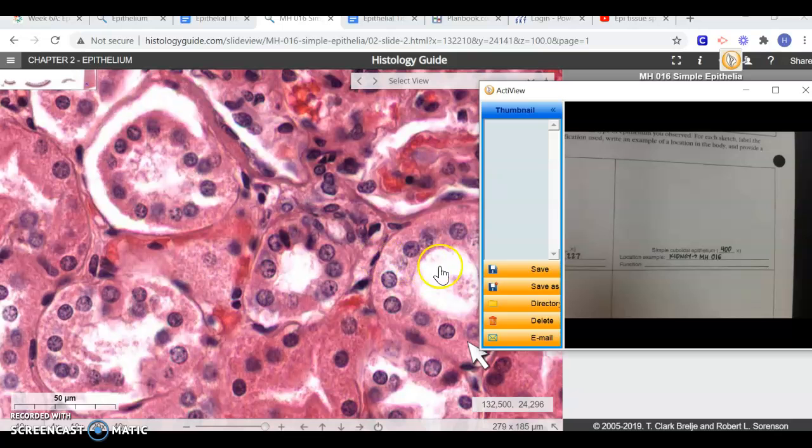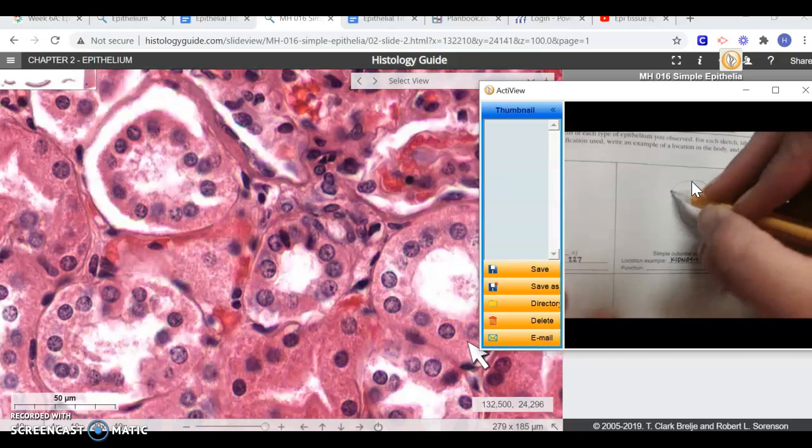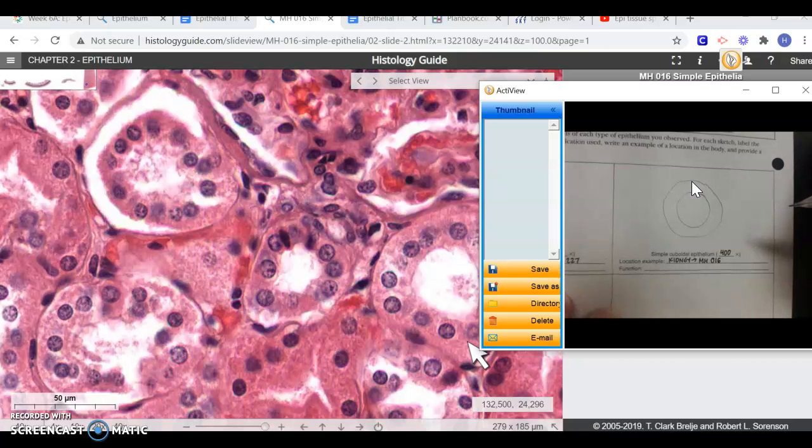And it's really cool how it's arranged, because if you'll see, it's in this circle. So we were talking in class and I said it kind of looks like a donut. So go ahead and draw that. And my recommendation is to use a pencil, because we're going to add some color to this. And so hopefully you can kind of see, and you'll see my drawing's not going to be perfect, but I'm going to do as best as I can to show what this looks like.